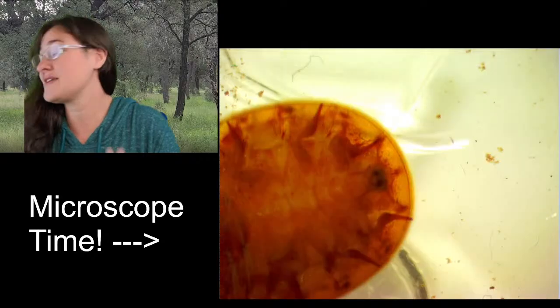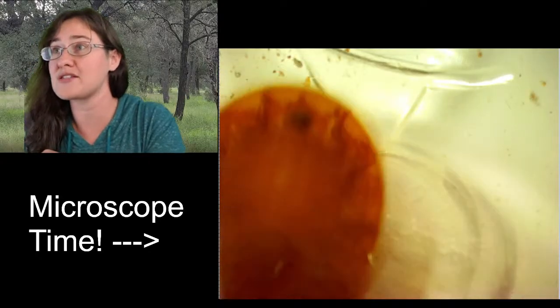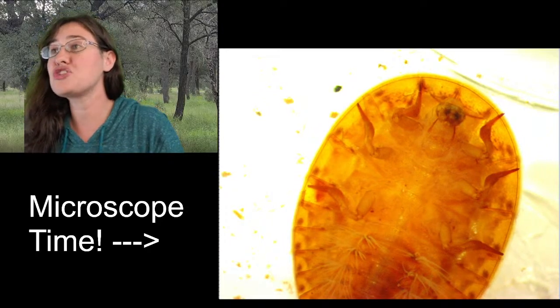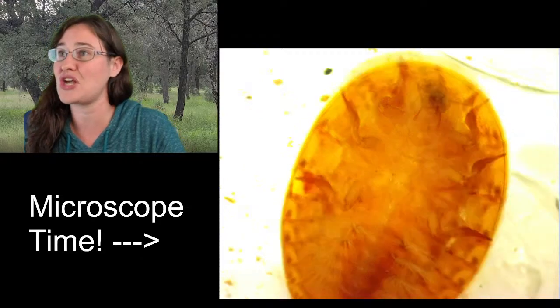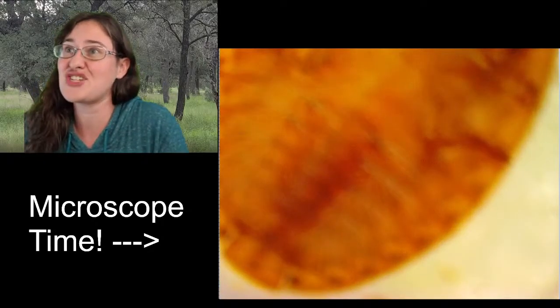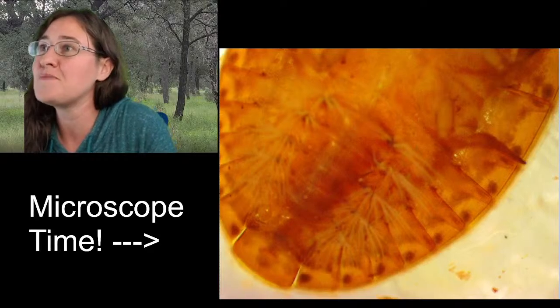When I started sketching and doing line drawings, I took inspiration from some of the line drawings in the Aquatic Insects of North America book because their sketches were so simple, just very simple lines, but they told you everything that you needed to know to get yourself to the identification, which is what matters in a sketch for a key. Sometimes people add too much to their sketches, and then it's hard to tell exactly which characteristic they're referring to. So check this out.